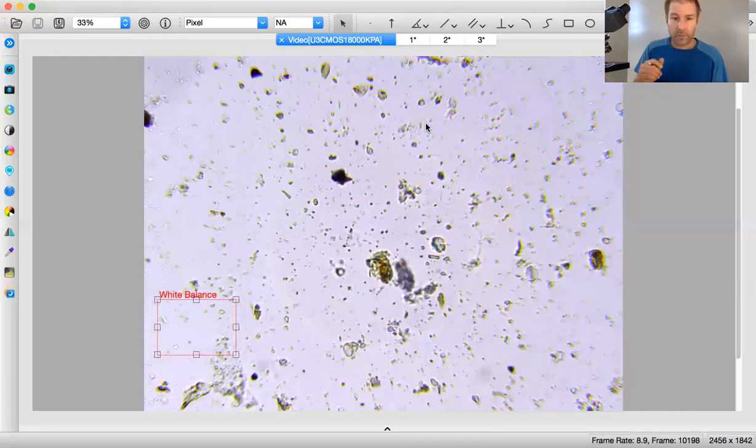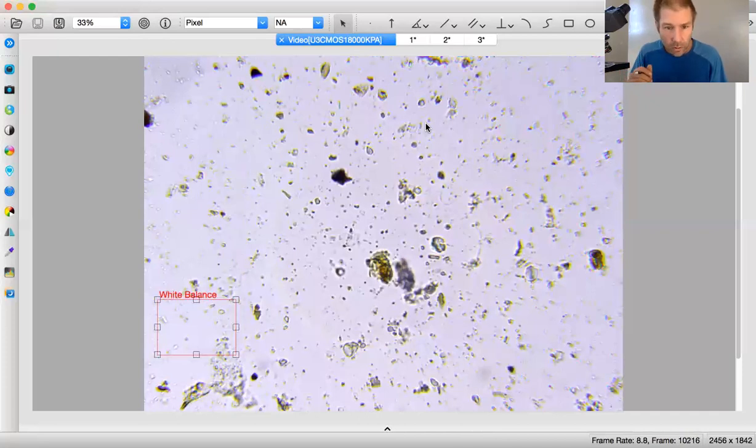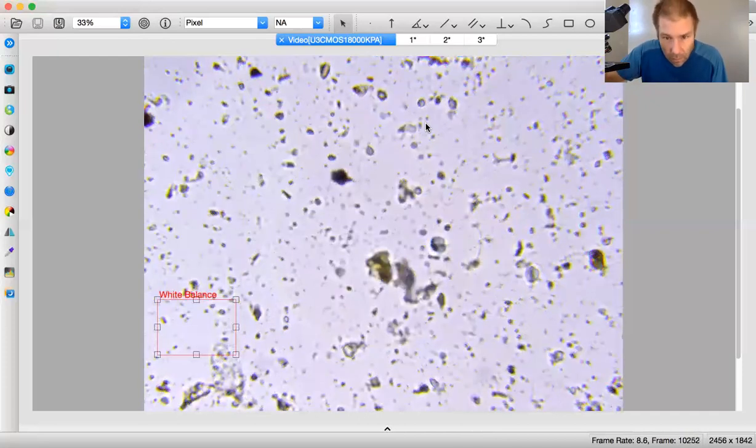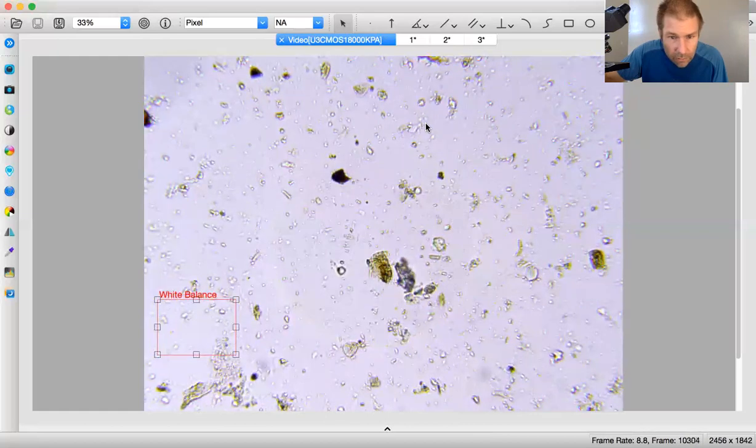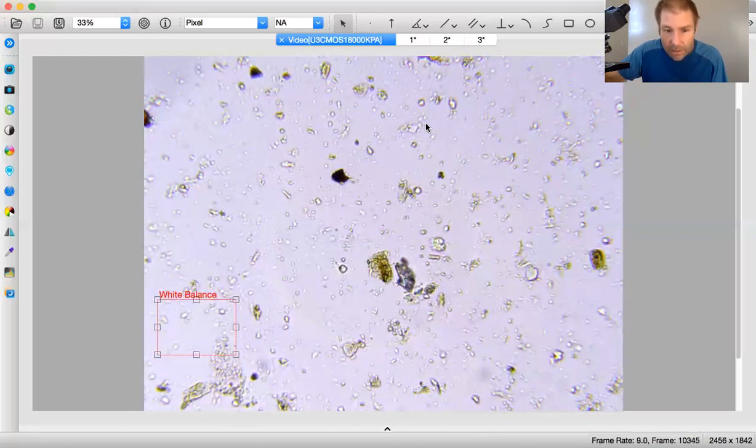Moving forward to field of view 4, reading area 1. Boy, this one's definitely thin, or lacking biodiversity, I want to say. I see actino right here.